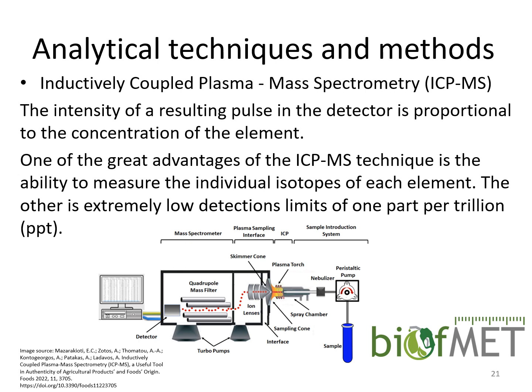That needs to be taken with some precaution, because the detection limits generally for all these methods that we mentioned depend strongly on the sample matrix. So particularly for these techniques, the detection system is very, very delicate, and samples need to be prepared carefully. They need to be clean from any possible interferences in order to allow such quantitative analysis and such low detection limits.